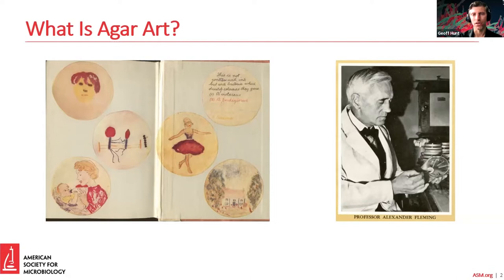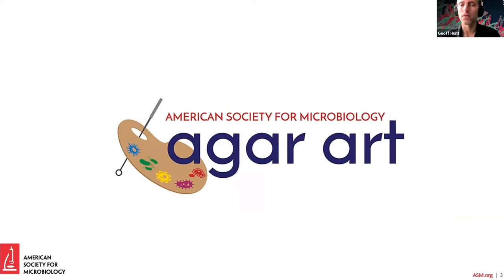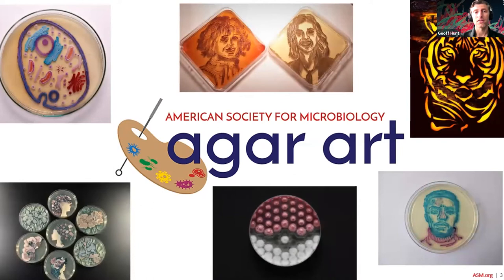So that was the initial inspiration for what the American Society for Microbiology has run, which is a contest for creating works of agar art. This has run since 2015. It is an international contest and we are currently running it right now. As you can see, we get some really amazing works of art that people create simply using microbes, different colored microbes, differential media, and different agar plates. I'll include a link at the end where you can check out all of the entries that we've had over the past couple of years.